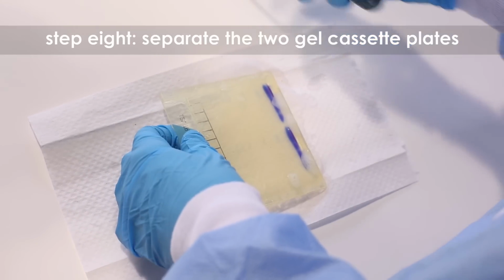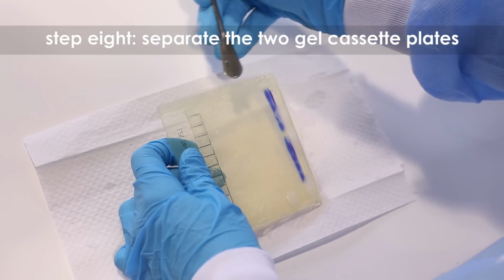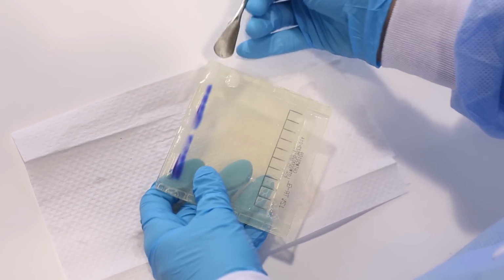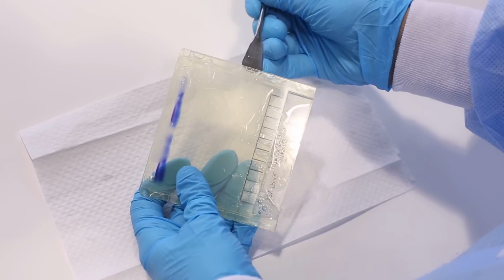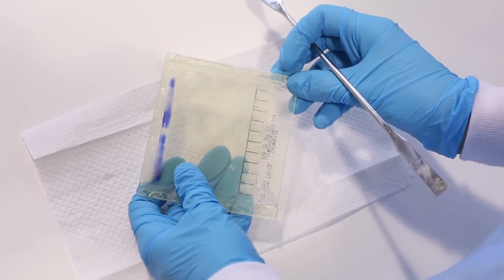Step 8. Using a spatula, carefully separate the two plates of the gel cassette. Place the spatula in the slot at the top edge near the sample wells. Twist the spatula to separate the two plates of the cassette. Repeat until the plates are completely separated.